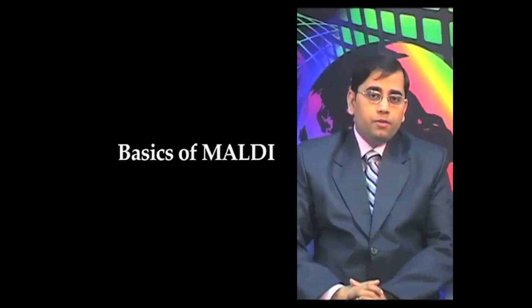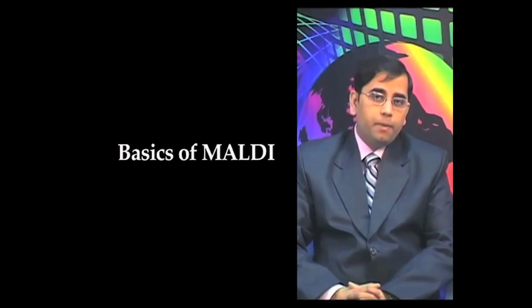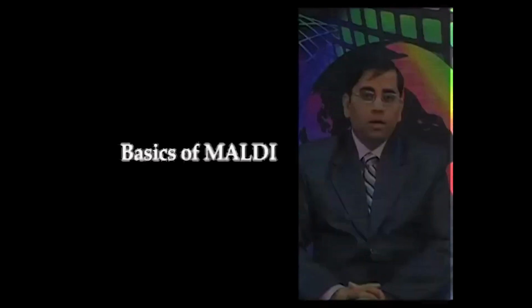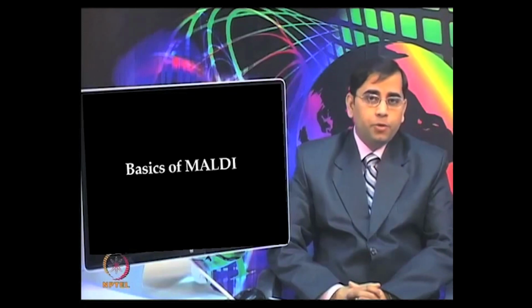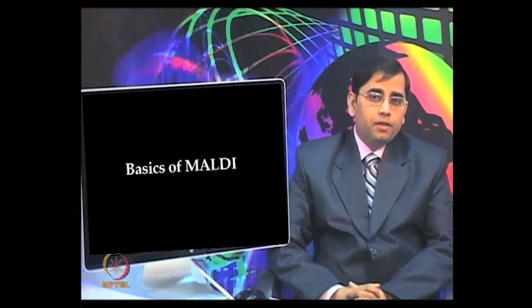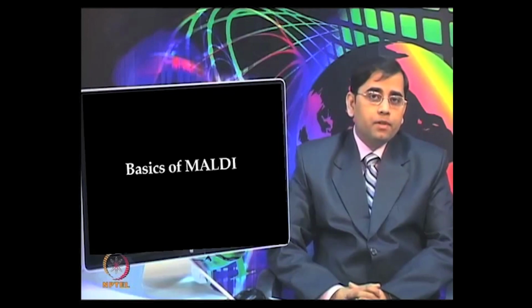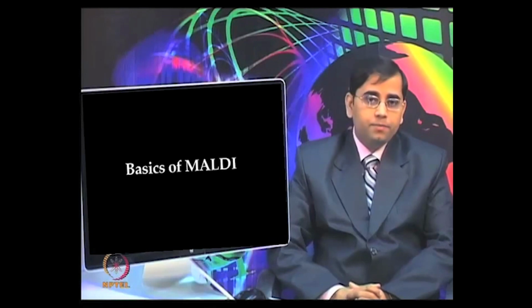Let us first start with basics of MALDI. So, MALDI is an efficient process for generating gas phase ions of peptides and proteins for mass spectrometric detection. MALDI is one of the most widely used ionization technique currently applicable in the proteomics area. This ionization method was independently developed by two scientists, Koichi Tanaka and Franz Hillenkamp. Tanaka also received the Nobel Prize for his novel contribution into soft ionization technique such as MALDI.